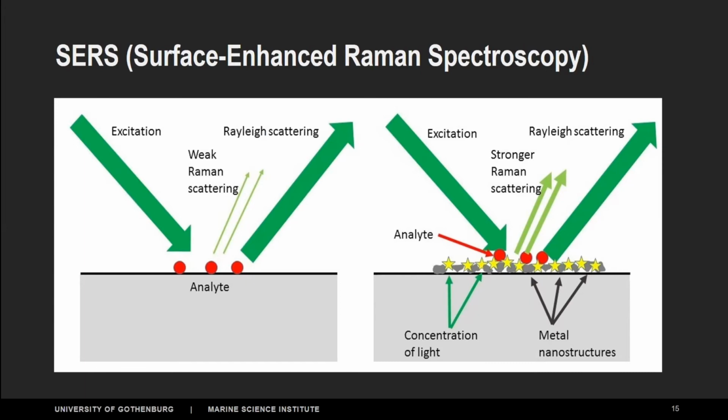But it's very tricky because it's a bit of witchcraft, as I'm saying. You need to prepare them, so you boil them. It's chemistry, you always boil things in chemistry. And of course, it helps if you have access to an electron microscope, so you see the size and the shape of the nanoparticles. But with Corona, with all the labs being closed, it was like looking at the color and guessing a bit, okay, is it good? Testing. Let's see how the results will look.